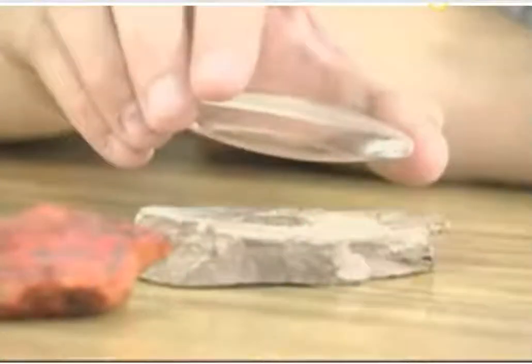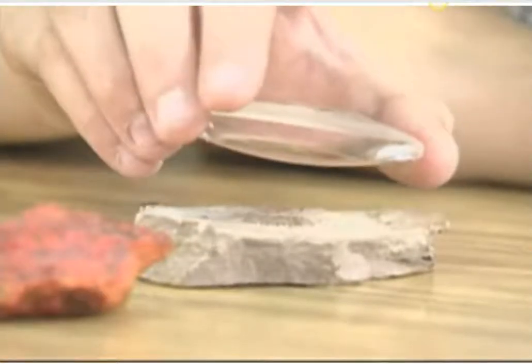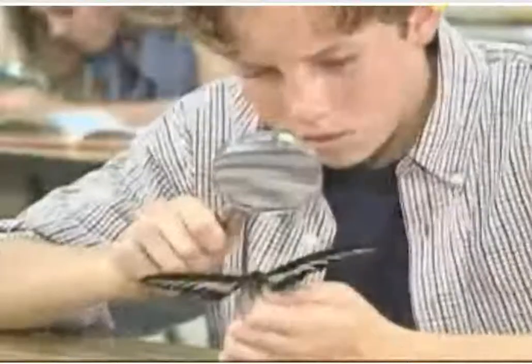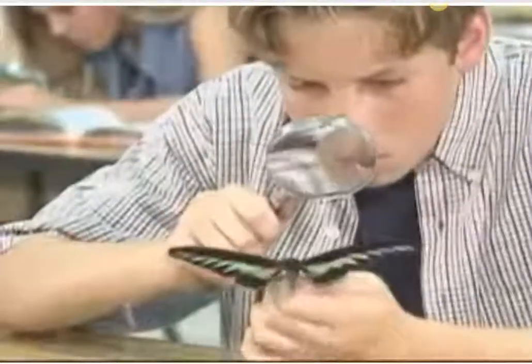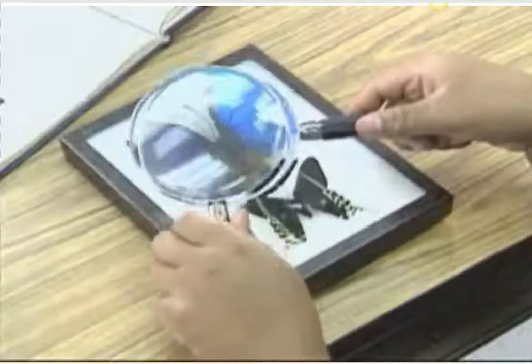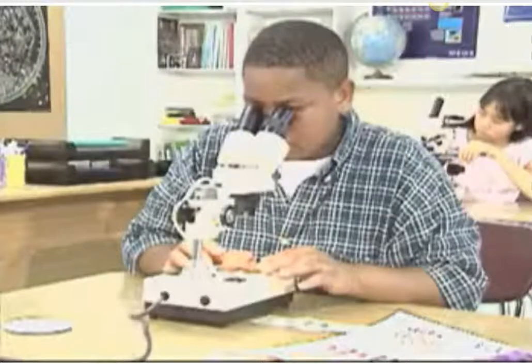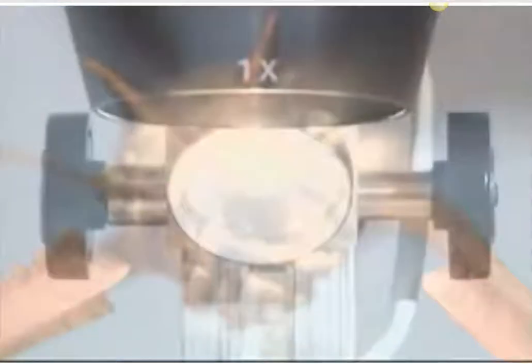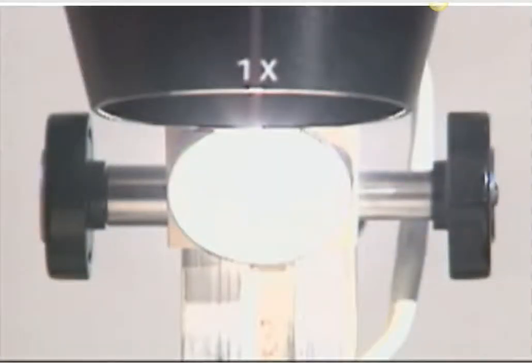In this program, we have seen how a curved piece of thick glass called a magnifier can be used to magnify a variety of objects, and enables us to observe the world in a way we couldn't otherwise do. When one lens is combined with another, it increases the overall magnification. That's why stereo microscopes are more powerful than magnifiers and enable us to see objects in even greater detail. With stereo microscopes, objects can be illuminated from above or below.